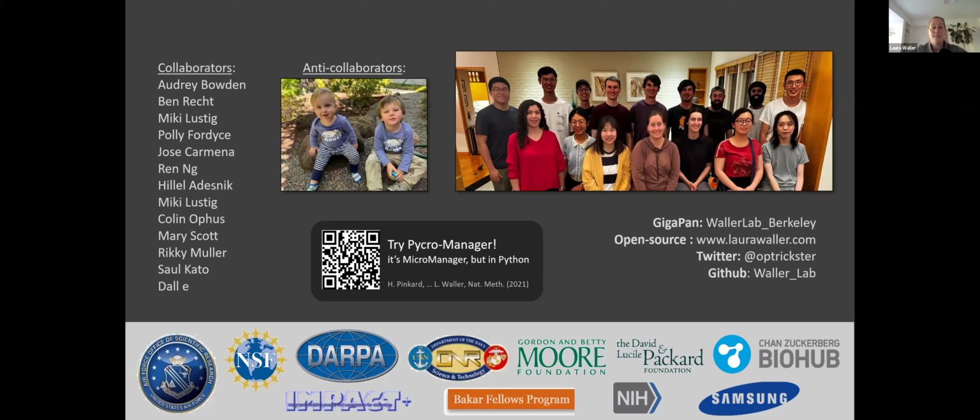But the LED array stuff certainly is getting more robust. Getting information out of all the phase contrast is amazing, because it's so hard to do automated segmenting, so just being able to get all this information would be fantastic. And I should say, with the LED array stuff, there are a couple of companies commercializing related things. Zeiss's new scanning microscope allegedly is going to have this essentially in it.